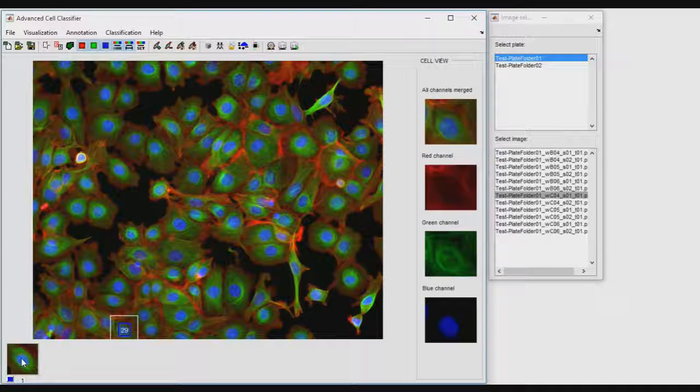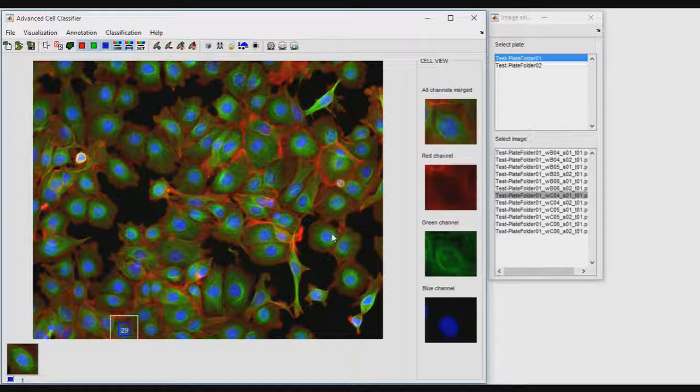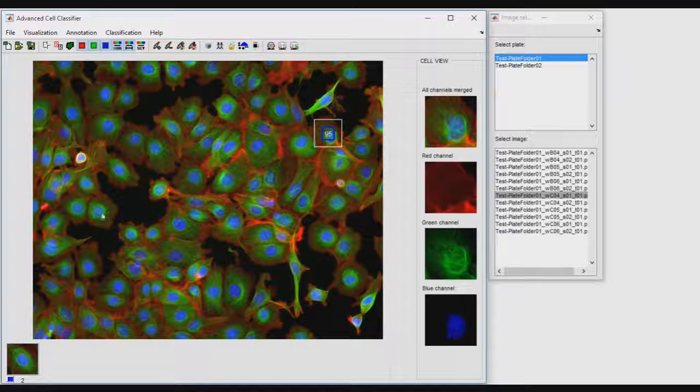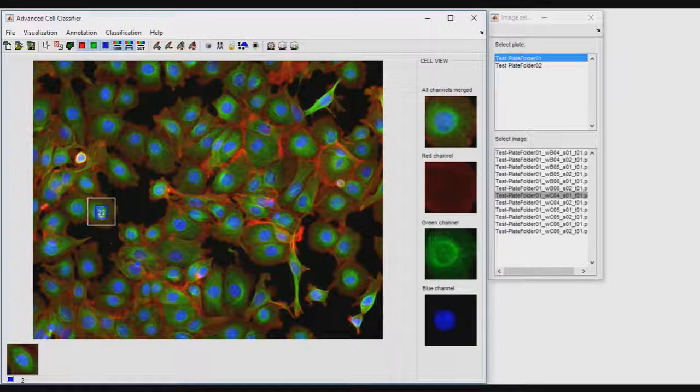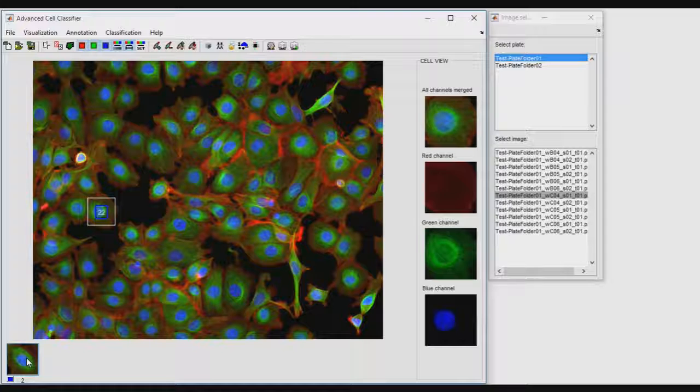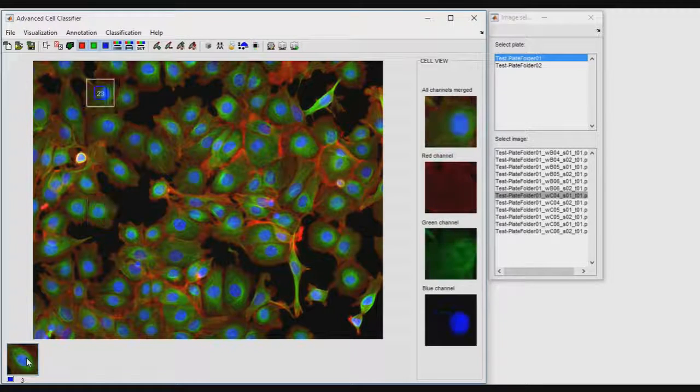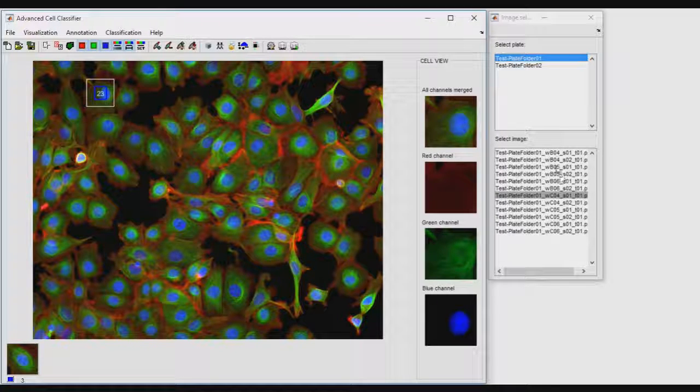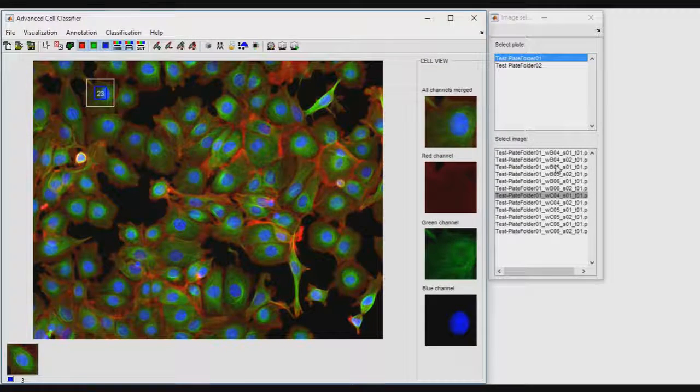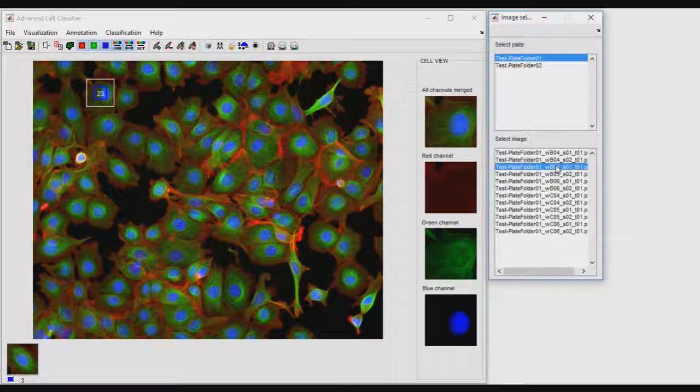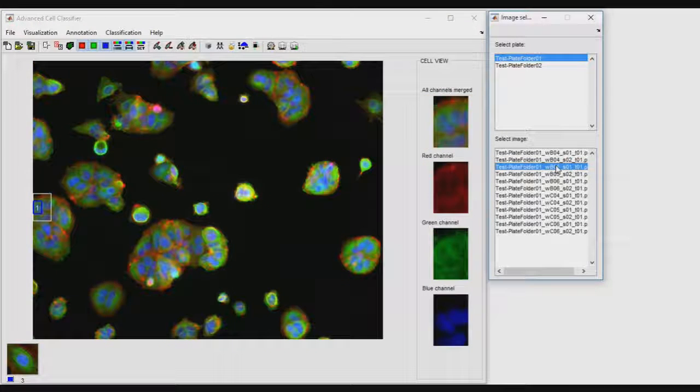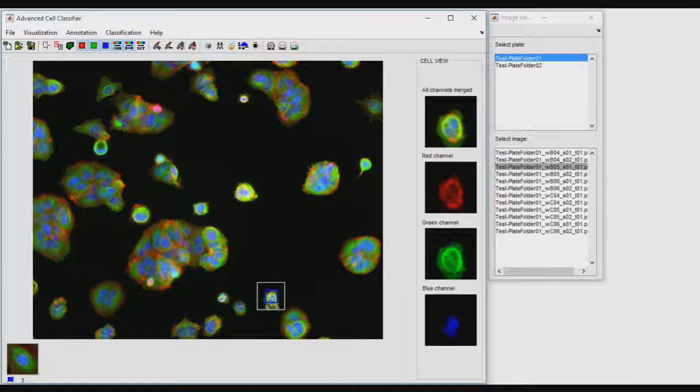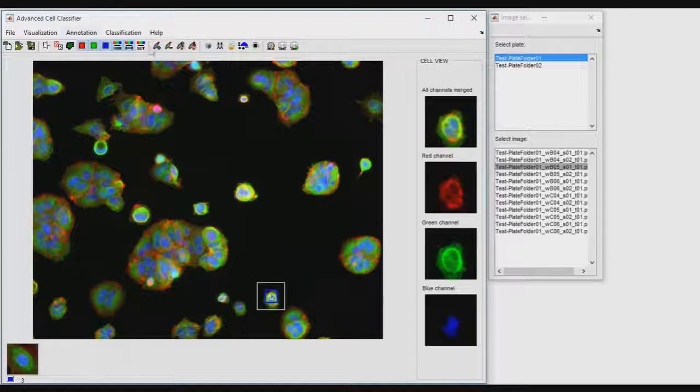To annotate a cell into a class, click on a cell and then on the icon of the class. You can repeat the process to create as many classes as you want.